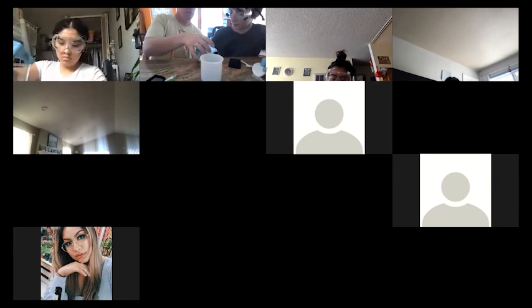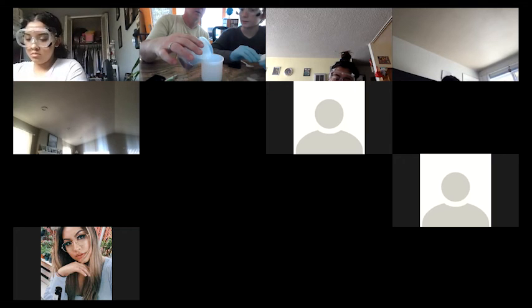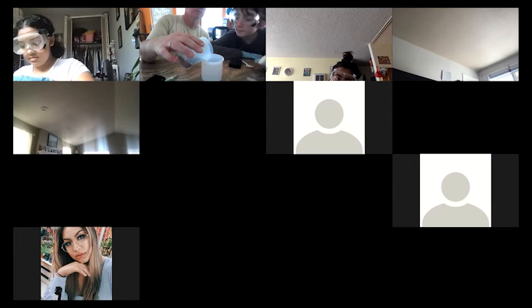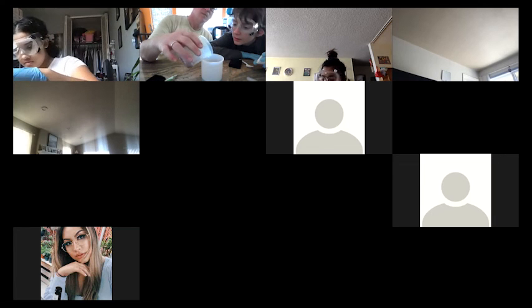Is that most of it? Mostly. Oh man, that's quite a lot of product, isn't there? That is quite a lot of product. That's almost all of it. Okay. Yeah, so get like 25 mils of water.